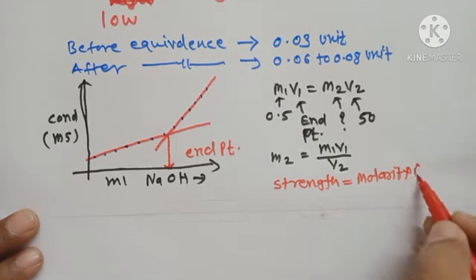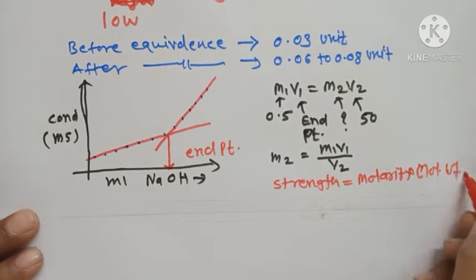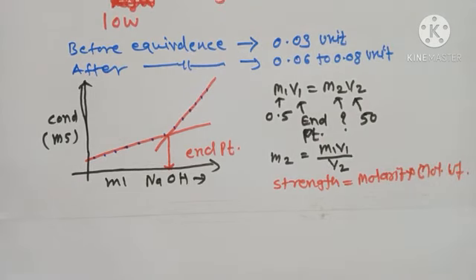Strength is molarity into molecular weight. By this way you can perform the titration and you can obtain the end point.